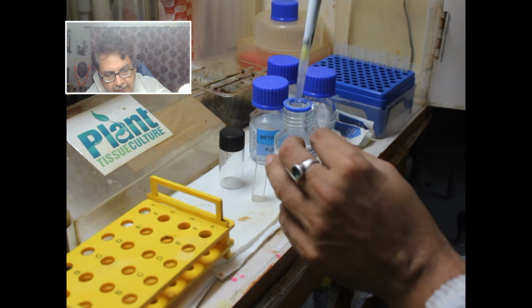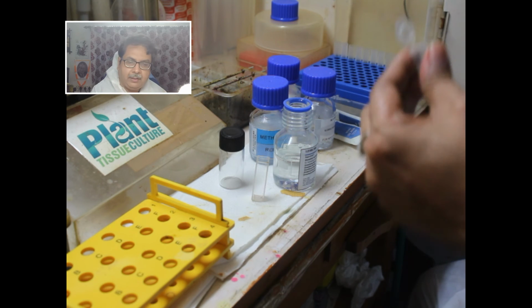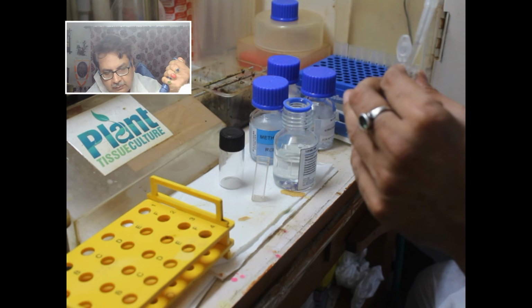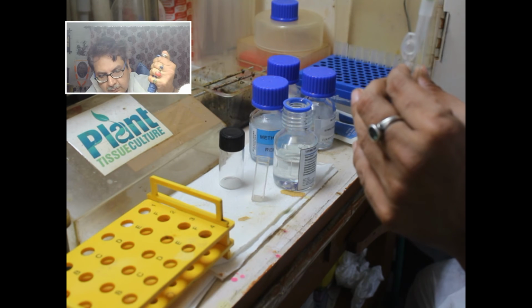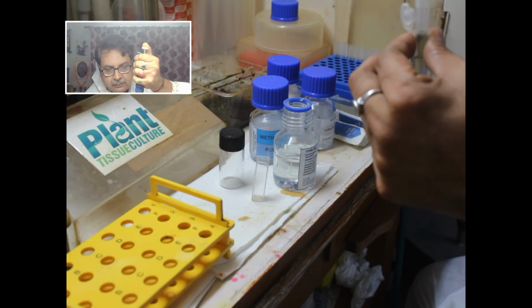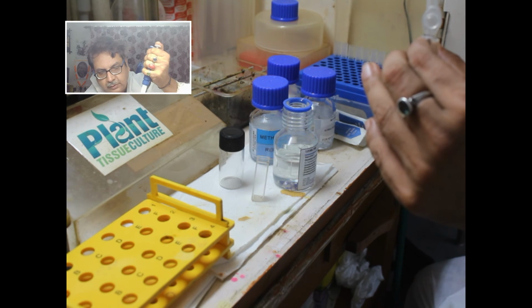So 2 ml of DMSO should be used. First of all we have to mix this culture media, this fungal base, with this DMSO.